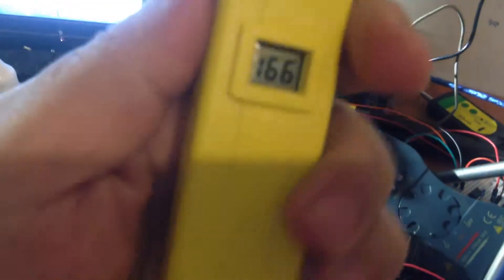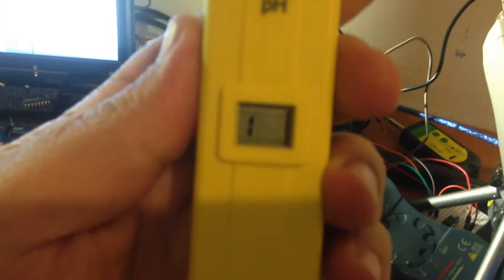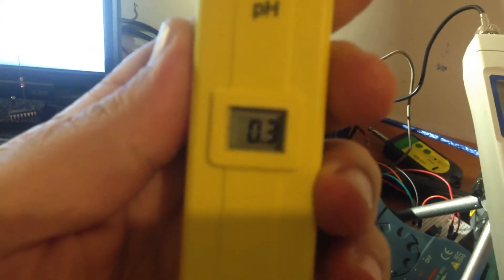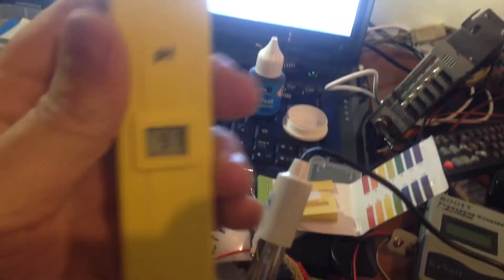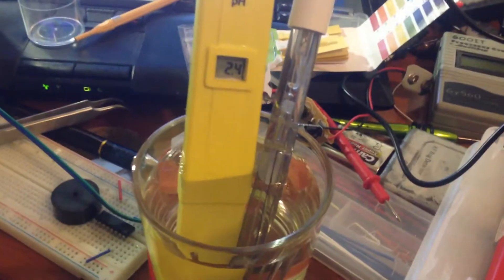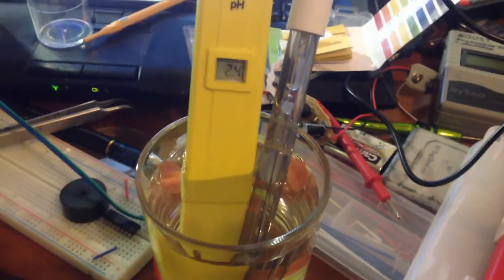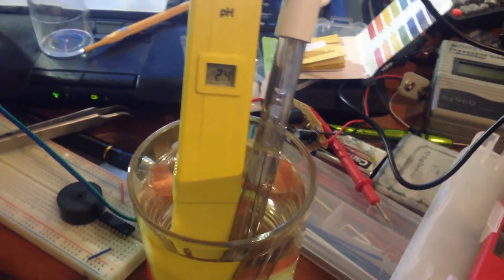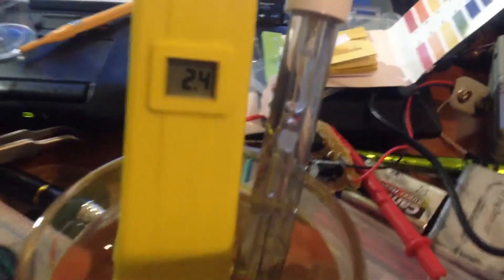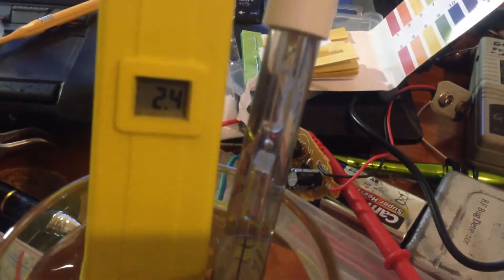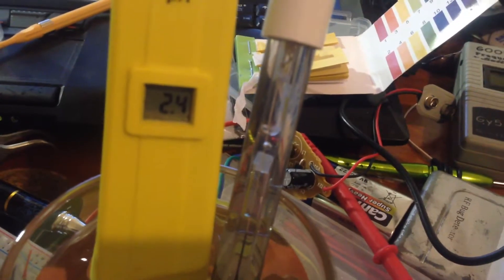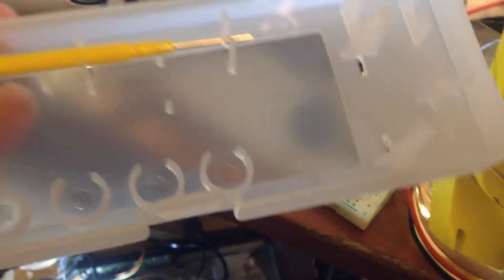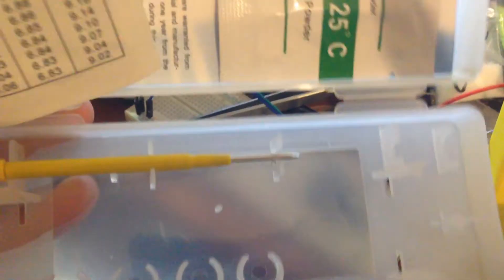I'm going to test with this non-calibrated pH tester. When I'm turning it on, it's starting by different numbers. I'm going to put it in the liquid so it will show 2.4.